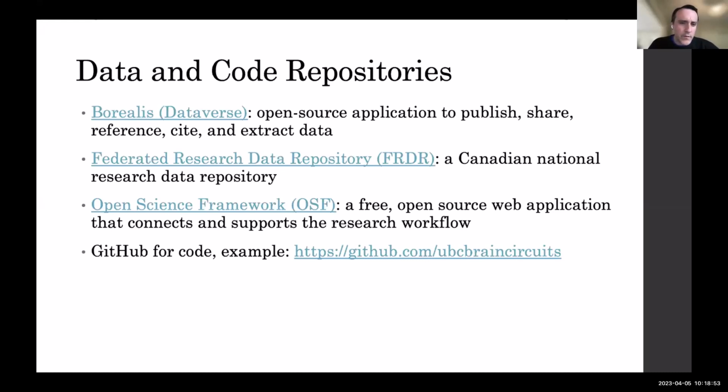We used Open Science Framework to host the materials for this workshop, so I think you've all seen it, and it is a free platform. If you're at UBC, you can sign in with your CWL, otherwise you just have to register with an email, and then you can use it to host and share data.